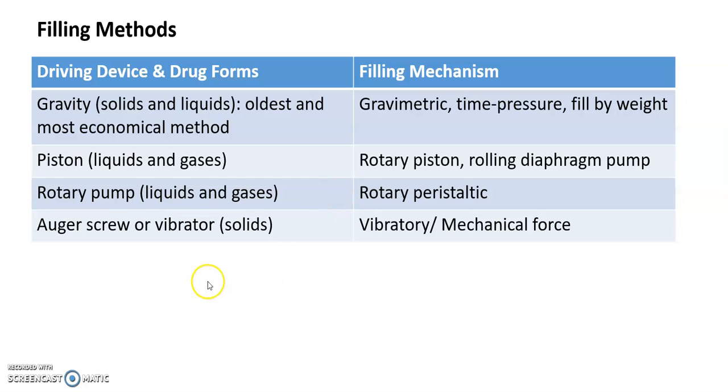And then if you're filling a solid drug or powder, normally you use a kind of screw machine that can fill the powder into a vial. So it's a vibration-based filling machine. Okay, so there are different ways of filling.